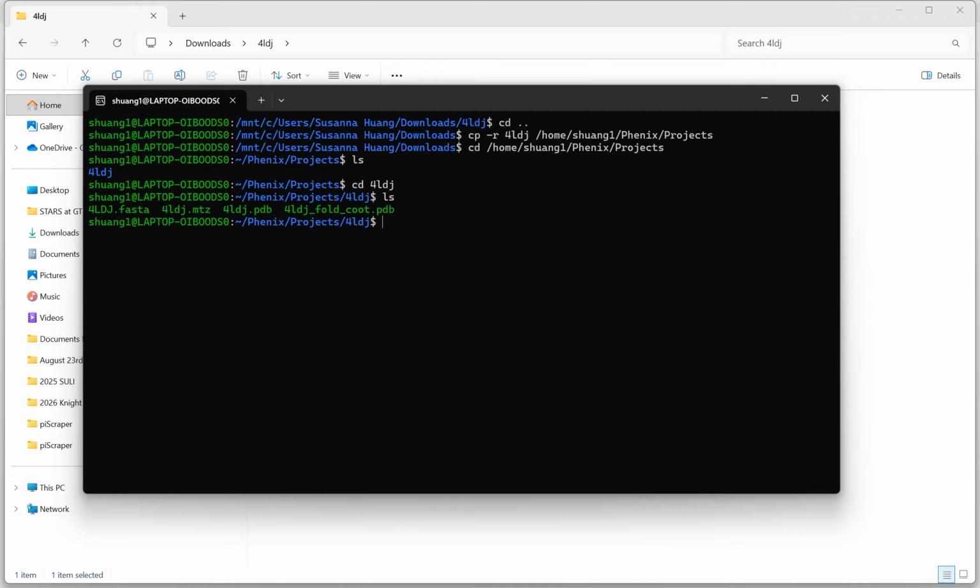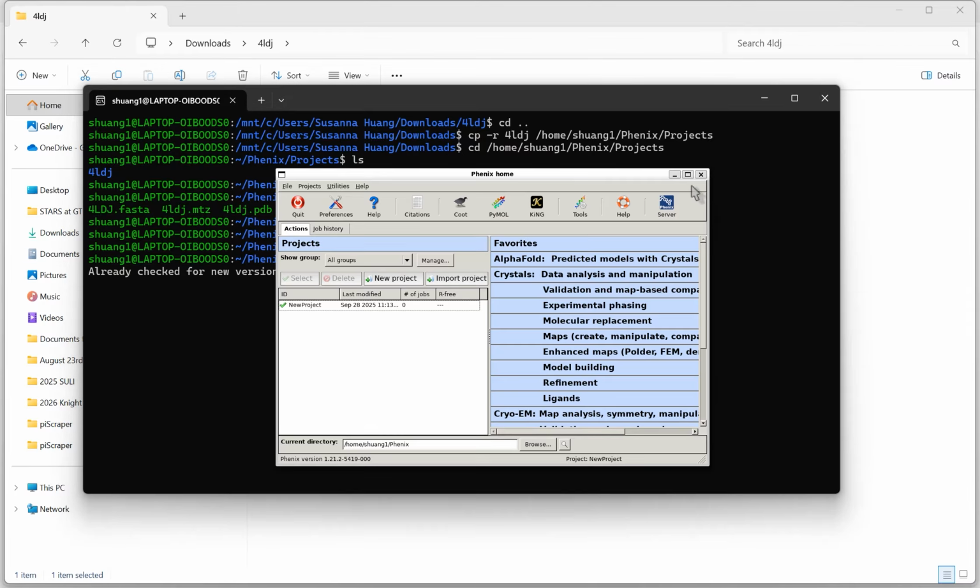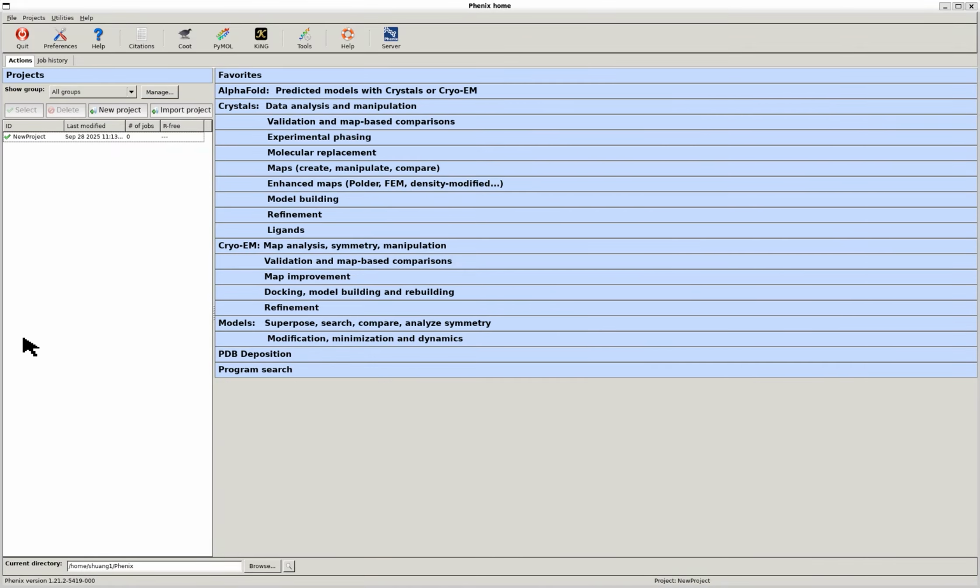Okay, with this, now we're going to open up Phenix. So we can go back, cd up into the projects folder and cd up into the Phenix folder, and then type in our sourcing command to say, hey, this is where to find the Phenix startup information, which is this Phenix, and then type tab, and then phenix_env.sh, and now you say phenix. Then you click OK.